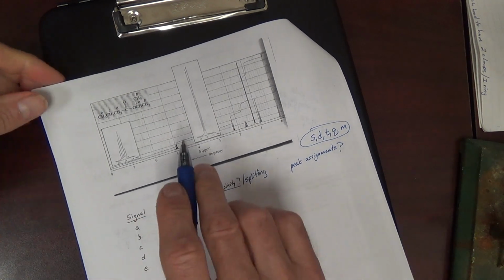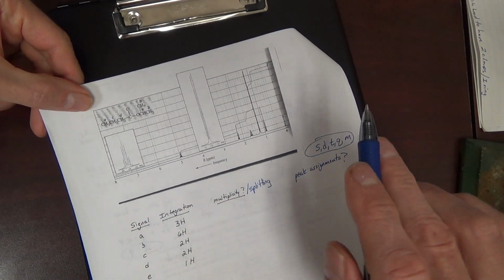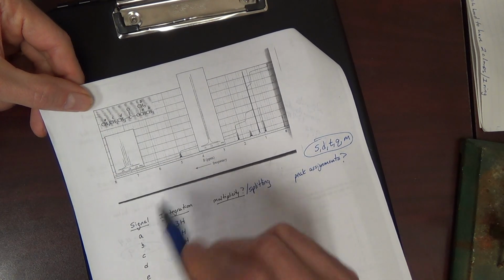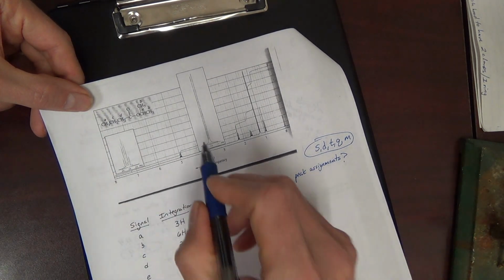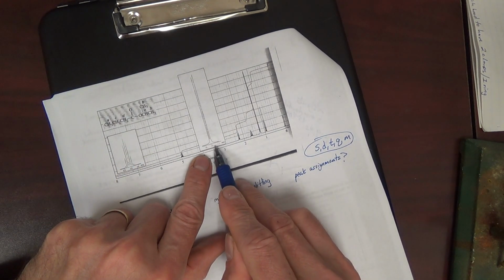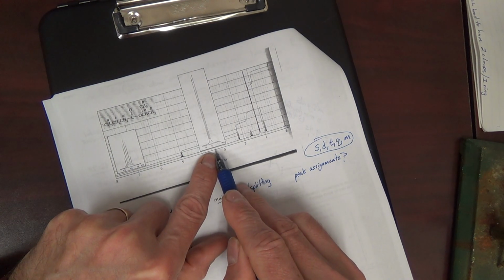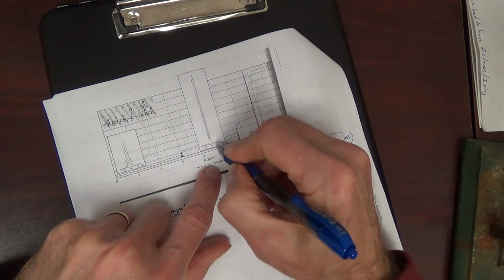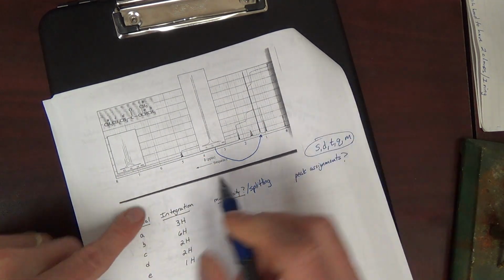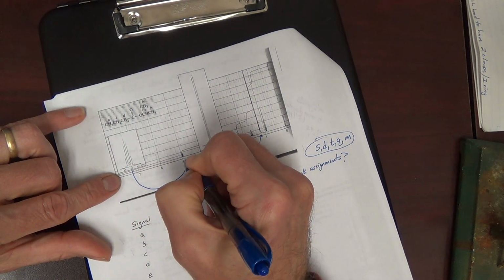By the way, this NMR is showing 5 signals, 1, 2, 3, 4, and 5. But they're also showing you an expanded view of 2 of the signals. See, this is 1 to 1.3 ppm. This is the expanded view of that signal. And this, 4.8 to 5, is the expanded view of this signal.